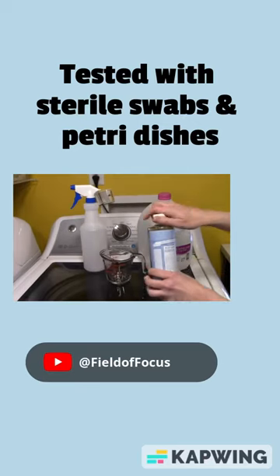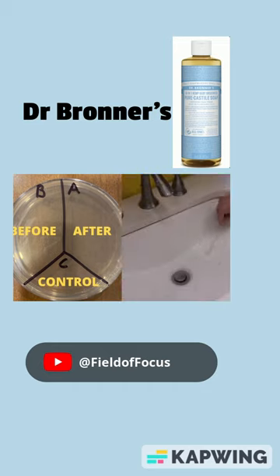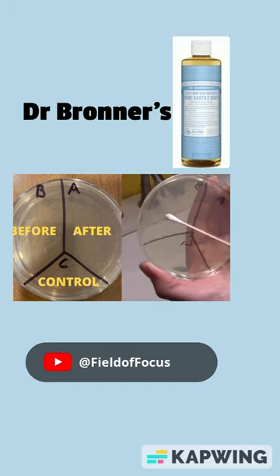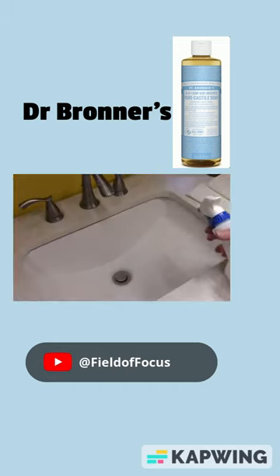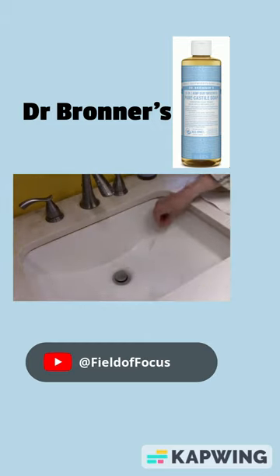Let's see how well Dr. Bronner's can remove bacteria from my home. I'm gonna take sterile swabs and a petri dish just like this and label it A, B, and C. B is before cleaning with Dr. Bronner's, A is gonna be for after cleaning with Dr. Bronner's, and C is my control — nothing's gonna go there.